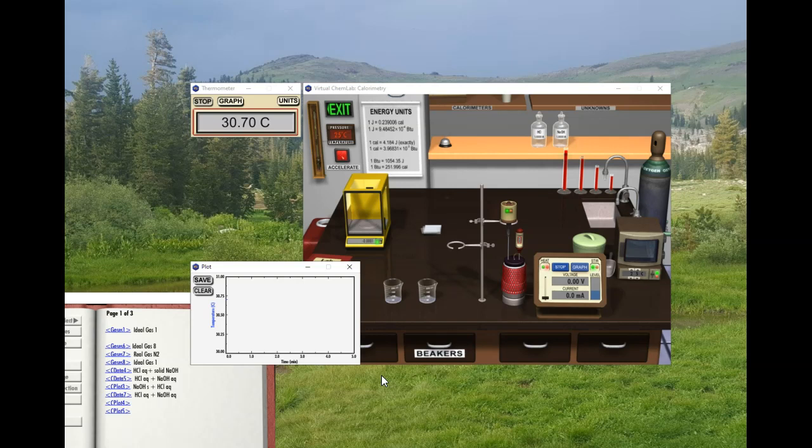And then you're going to be able to do all of this data interpretation on the last page, page 46. So let's go through the data and I'll put it up for you so that you can see what we got here. So first one was the solid NaOH dissociation. It's on the next page. So I'm going to pause this for a sec, get the data for you. I'll do them in order, reaction 1, reaction 2, reaction 3, so that you can have the data.